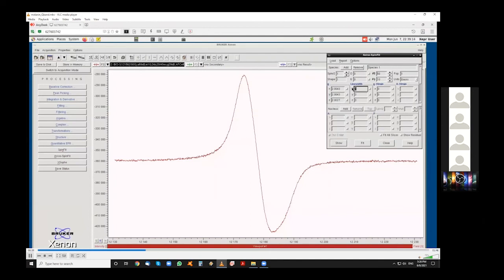In this case, the G values and the line width values are chosen as a result of some previous measurements that I've done. So we will complete all of them. We can say that at the beginning in the X band, when we supposed that we have only one center, it was just an assumption.